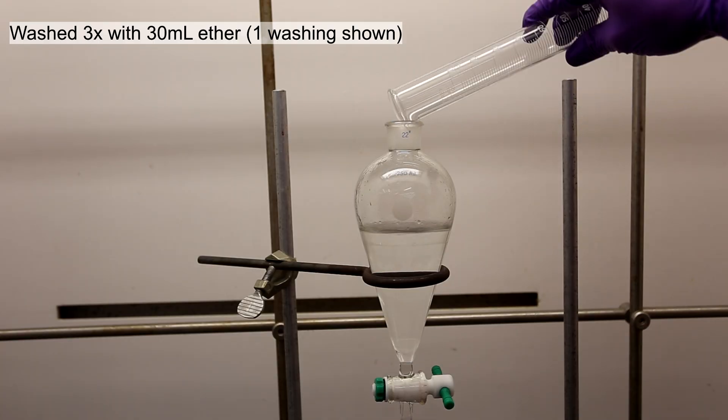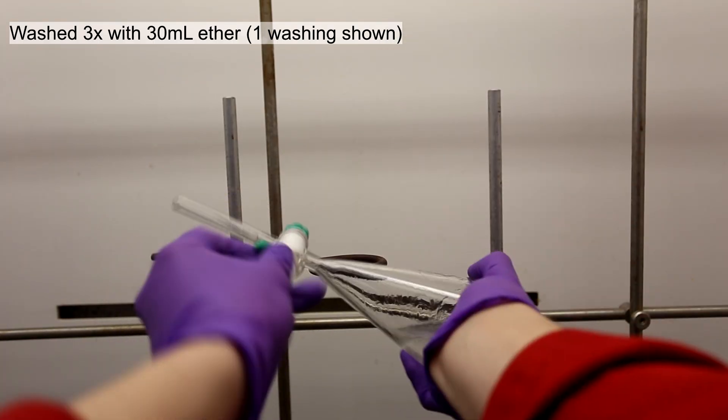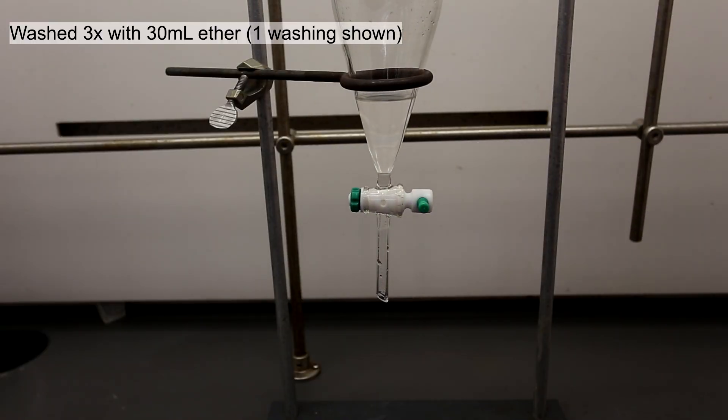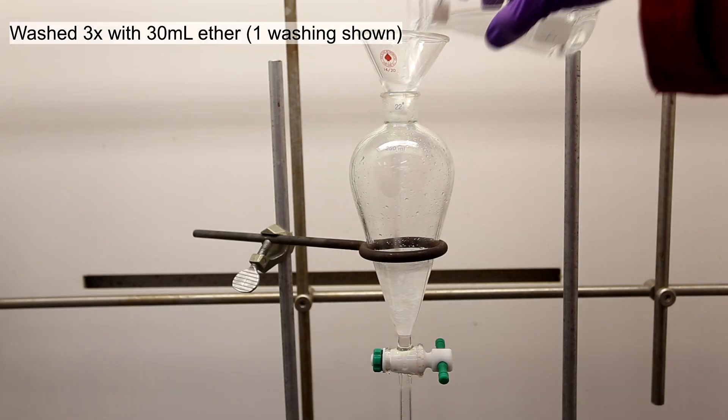The butyric acid was then extracted using 30 milliliters of ether 3 times. Remember that it's always better to do multiple washings with a smaller volume than one washing with a large volume.